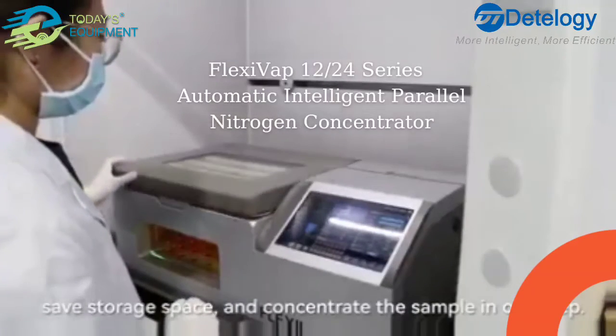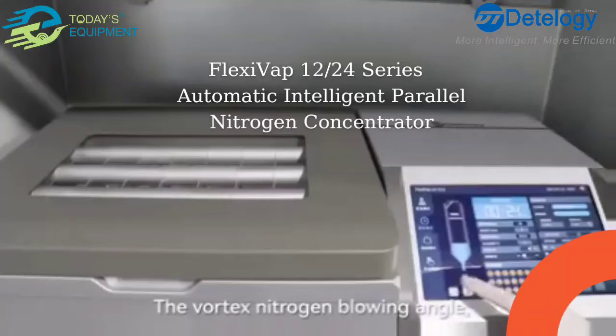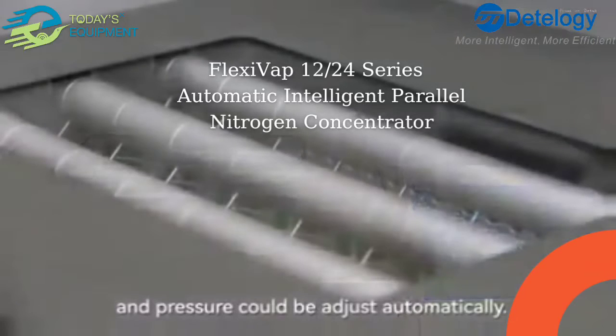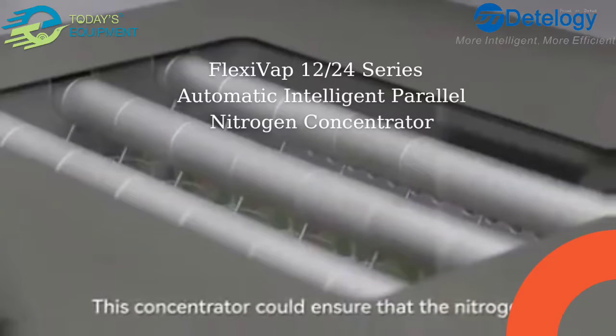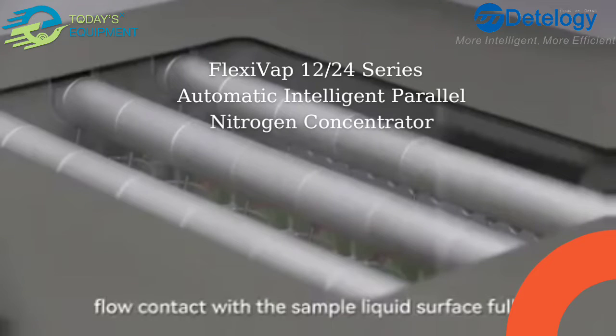The device concentrates the sample in one step. The vortex nitrogen blowing angle and pressure can be adjusted automatically, ensuring that the nitrogen flow contacts the sample liquid surface fully.